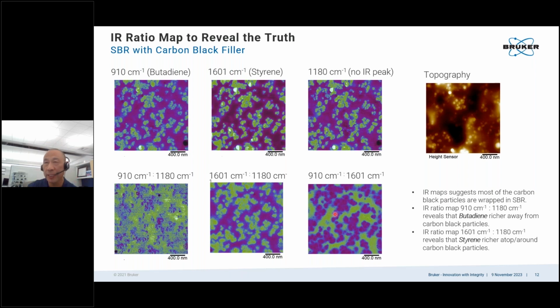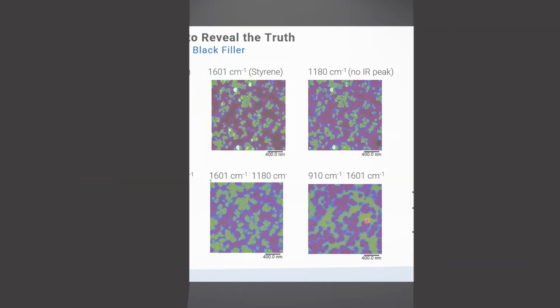So we can see something. We speculate there may be some phase separation. So here we go, we can see it clearly.